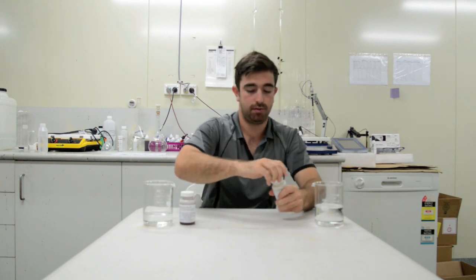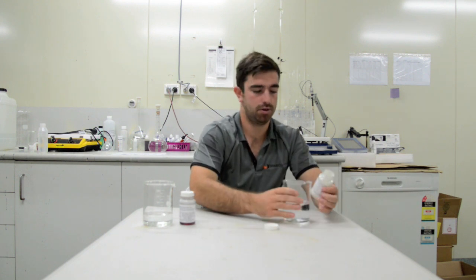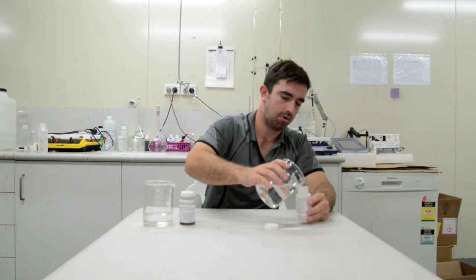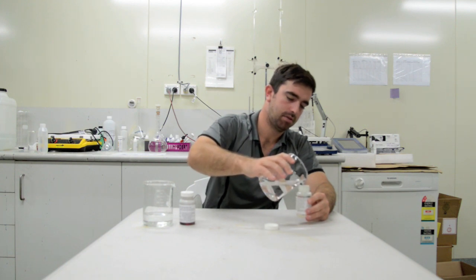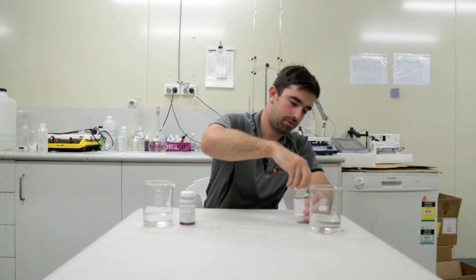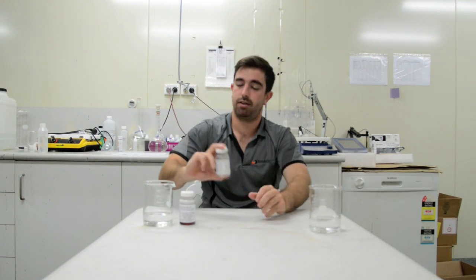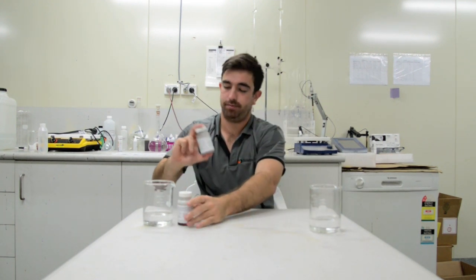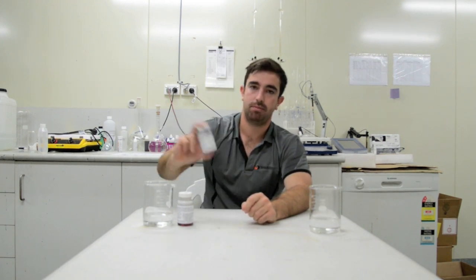Same thing — remove the lid, make sure not to touch the inside. Very important. Pour all the way to the centimetre towards the top. Once we get there, put the lid back on and shake. Now they turn purple. Just shake this until the medium dissolves.